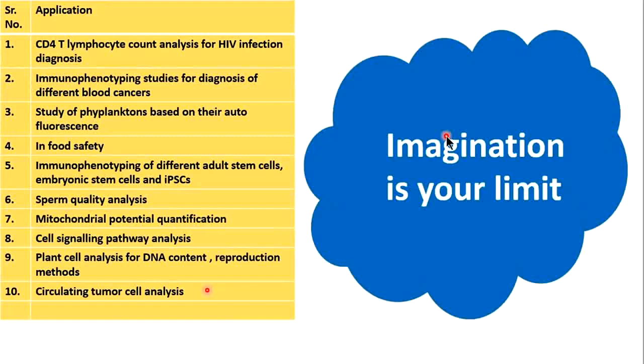And somebody asked me, what are the limitations of flow cytometry? Then I always give this line: imagination is your limit. Imagination is your limitation. If you can imagine one experiment, and if you have cells and protein information with you, you can analyze anything on flow cytometry. And here comes my last advice.